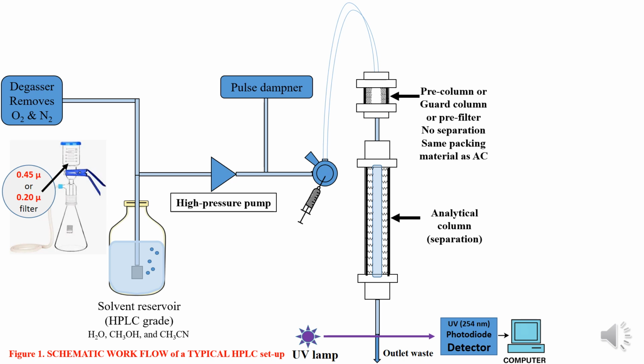Now let's inject the sample mixture into the column using a multi-port valve, which is part of the setup. The sample mixture contains three components A, B, C, molecules highlighted in different colors: red, blue and green. And the sample mixture with the components passes through the column along with the mobile phase.